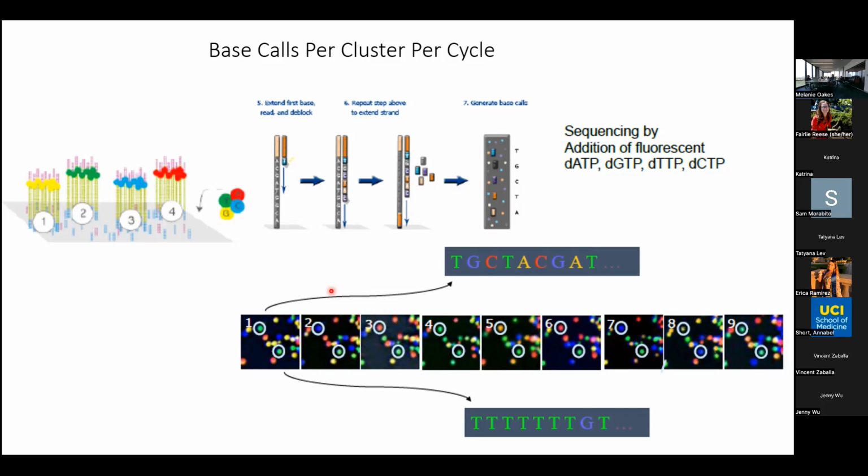And keep in mind that when we add on those adapters, they're at least 60 bases. So when we're looking at the size of the library, we're talking about your DNA, your insert size, as well as your adapter size. If we go beyond our insert, is that just kind of like...? It just means that you need to do some trimming. You would want to trim off your adapter because it's not going to align. And most of your FastQC programs will tell you how much adapter sequence you have.